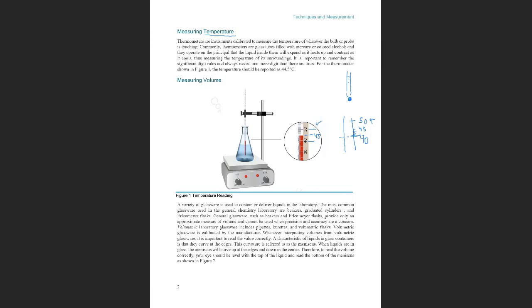Okay, you please answer. You can message or unmute yourself. 41. Yes, Carissa. But you have to look at the difference. One is 40 and the other is 41. Perfect. What is the difference? 41 minus 40. Yes, 1, Carissa, perfect, 1 Celsius. And that is the key for each instrument. I will tell you why.